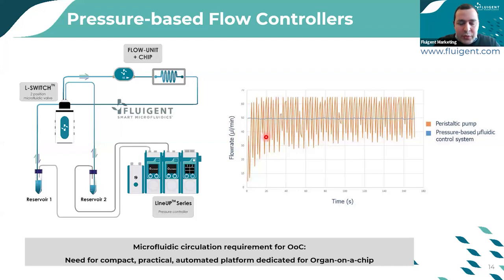As you can imagine, with these types of oscillations in peristaltic pumps, it's not the best solution when you are coupled to sensitive cells, for example, and microfluidics at the micrometric scale.